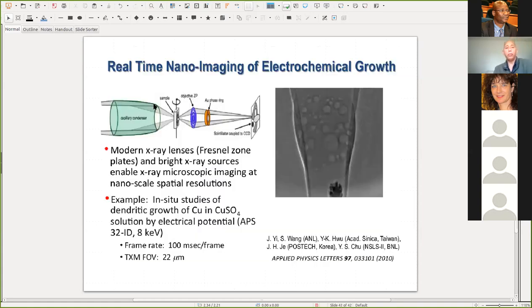Okay, so there's tomography and simple TXM work. I'll step through this quickly. First of all, you shine light on a sample. There's the mirror that bends the beam onto the sample. Then you have this high resolution lens, and then a detector. This allows you to take essentially X-ray images. You can think of it like an optical microscope: this part here is like the lens right next to the sample when you're looking under a microscope. This thing over here is like your eye, except it goes through a computer and you look at it on the screen.